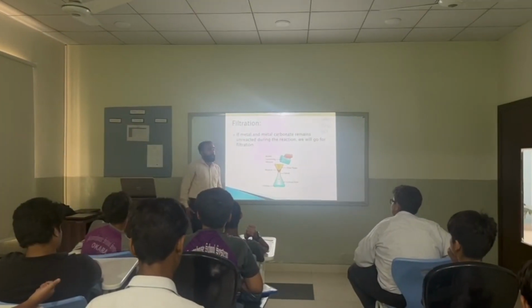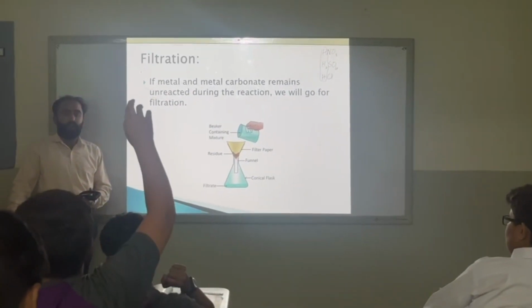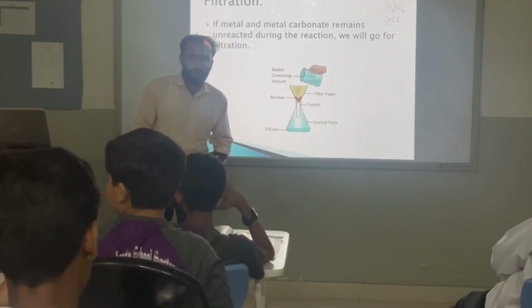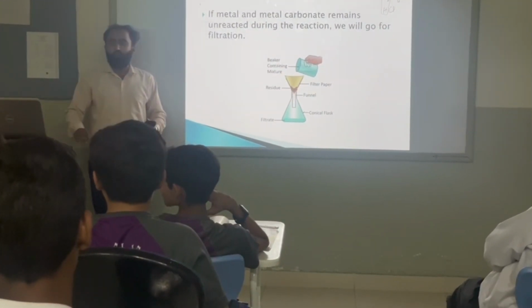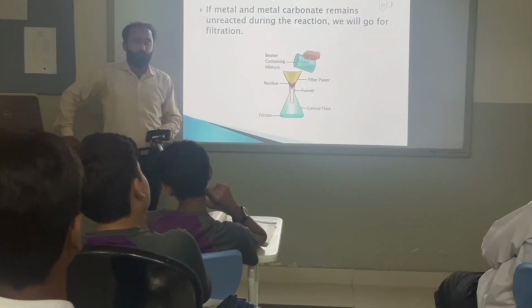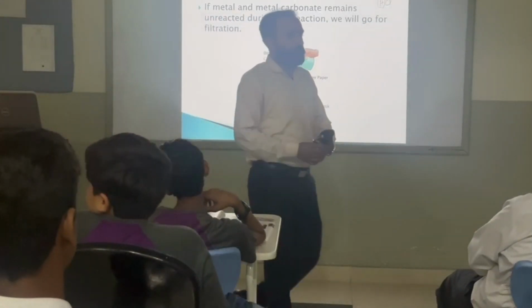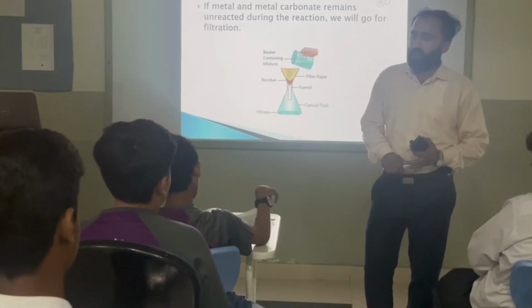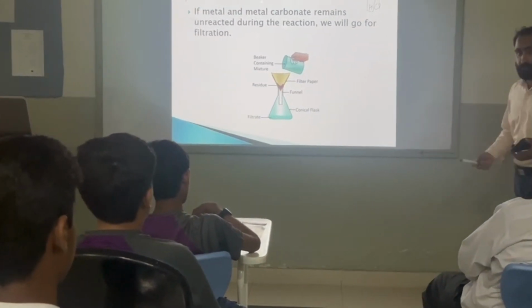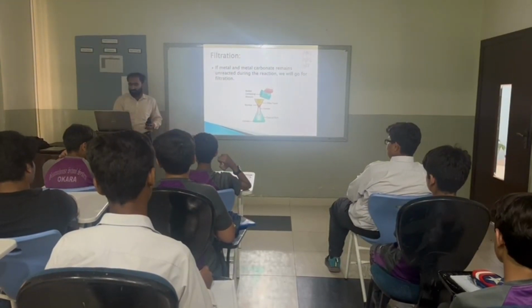That's great. Okay, I have also told you about the fluted filter paper, dear students, and I have also told you the folding of fluted filter paper and the folding of simple filter paper. We will do that in our lab, and the lab will be conducted after the explanation of the topic. Okay, we will go there and I will explain that over there.